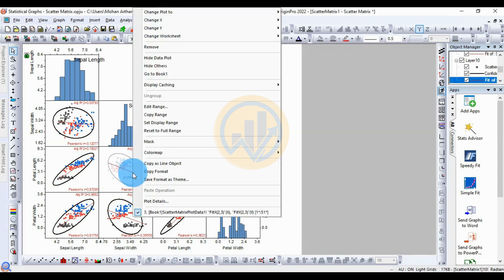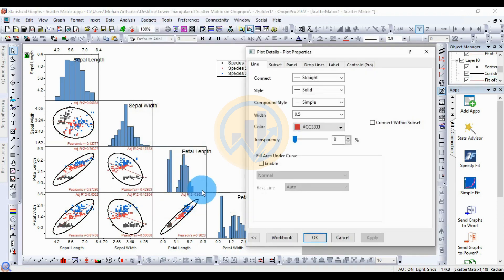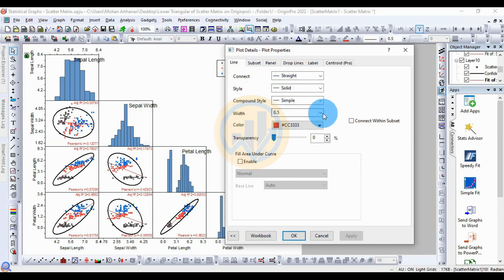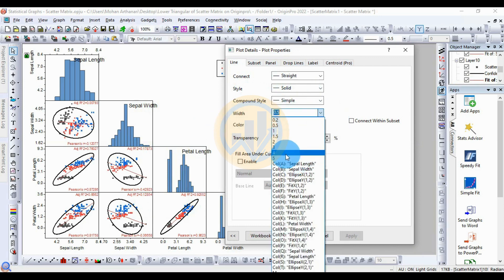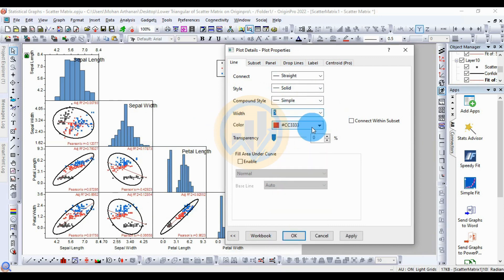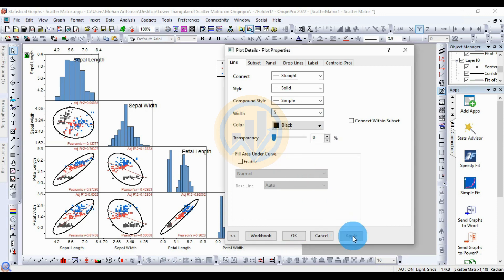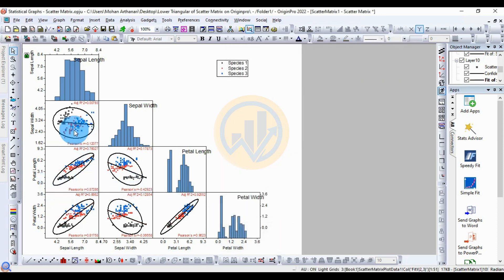Right-click on the linear fit lines to open the Plot Details dialog. Set the style to solid, compound style to simple, and width to 5. Then change the color to black and click Apply. The linear fit lines now appear in black.